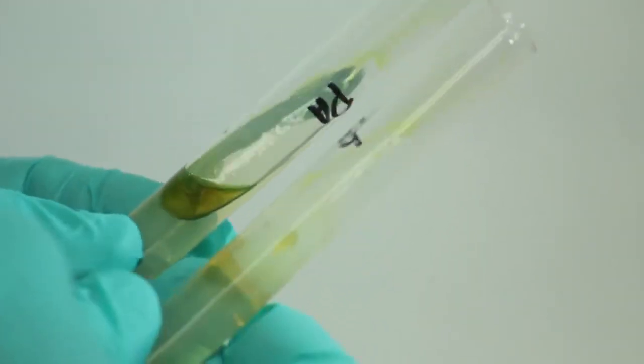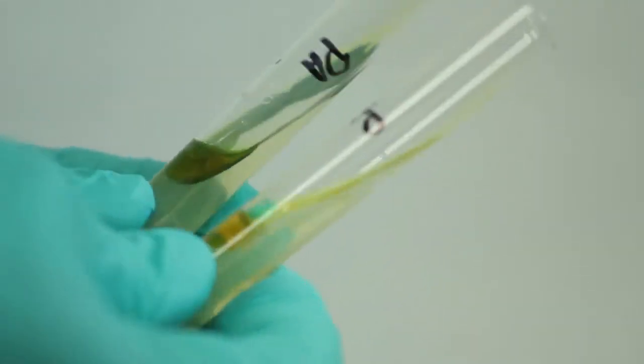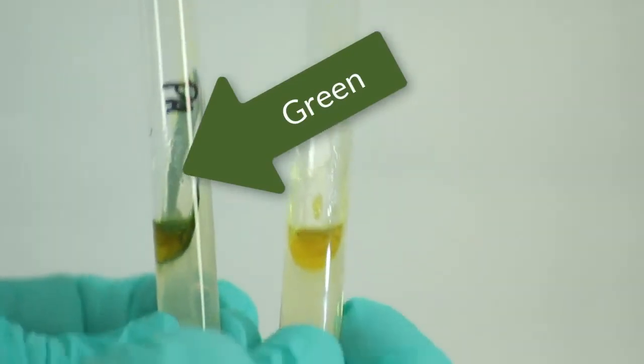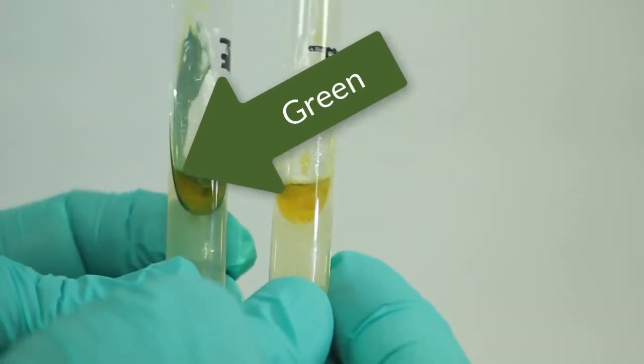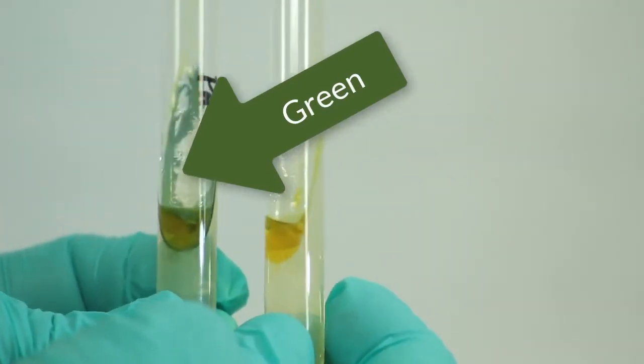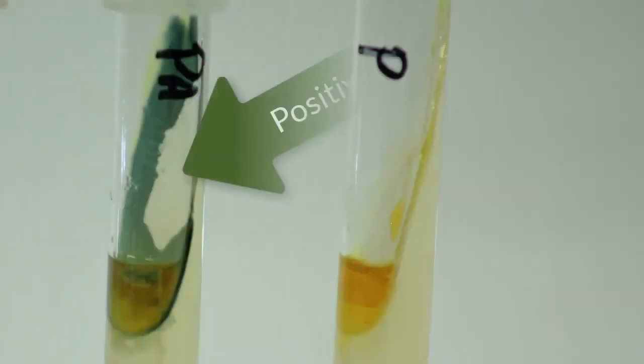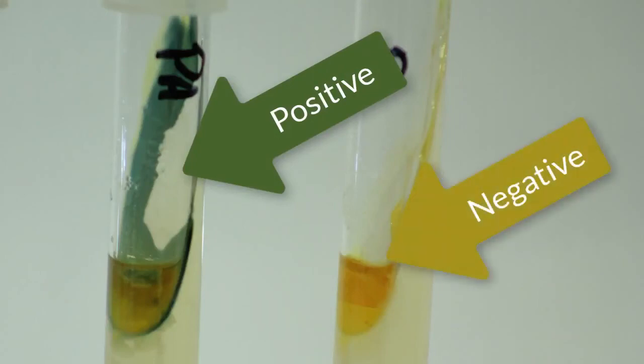A reaction for phenylalanine will appear as green. Notice at this time this tube is bright green already on the slant and all the way to the base of the slant, while the other tube is still yellow. So this tube is positive and this tube is a negative reaction.